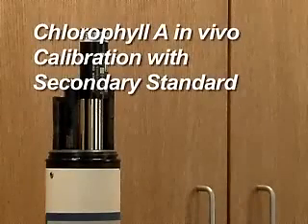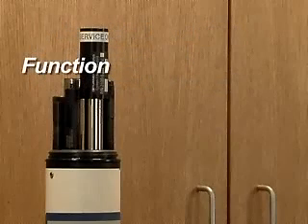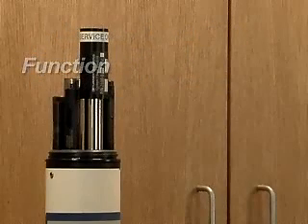Chlorophyll A in vivo, calibration with secondary standard. Function. The chlorophyll A fluorometer emits blue light into the water sample, which is absorbed by the chlorophyll A in the algae. The chlorophyll A fluoresces red light in return, which is detected by the sensor.